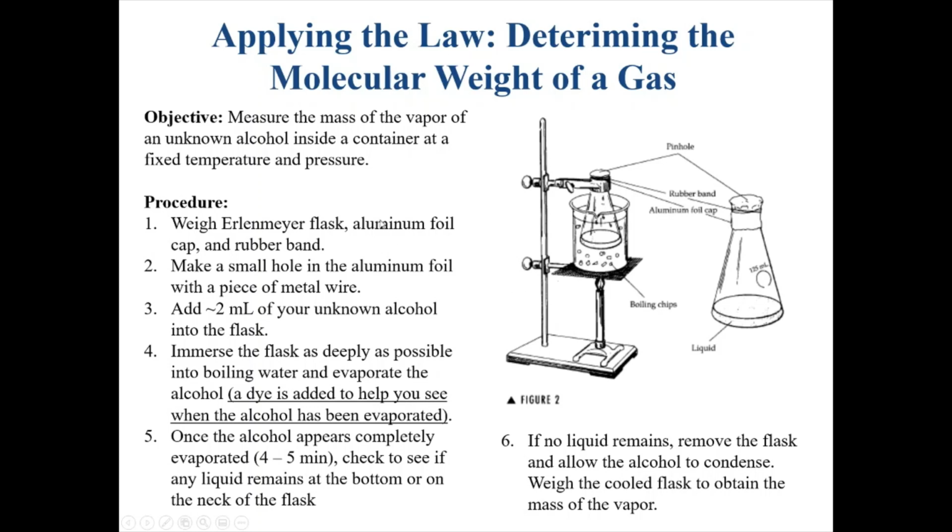Okay, so the second part of this experiment is going to focus on using gas laws to accomplish a goal. And the goal that we're going to accomplish is to measure the molecular weight of a gas that we don't know what the molecular weight is. So how are we going to do that?